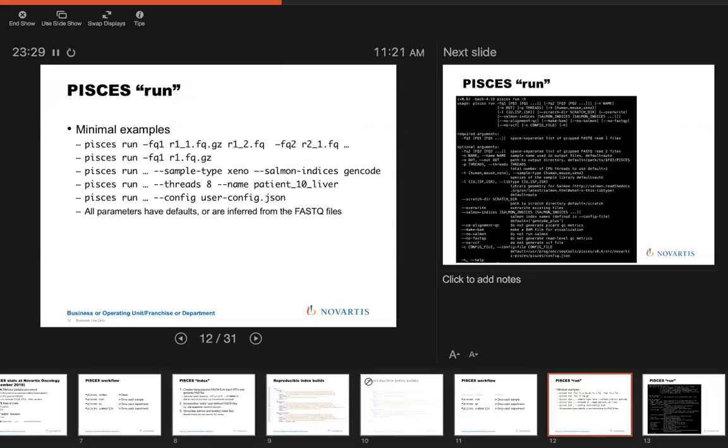You can also say this is a xenograft, right? Sometimes we have xenograft samples that have very little mouse contribution. By default, I call something a mouse if it's greater than 95% mouse. Something's human if it's greater than 95% human, and anything in between is a xenograft. It's usually reasonable, and that's one case where I've actually run thousands of samples and built an empirical distribution from our real data.